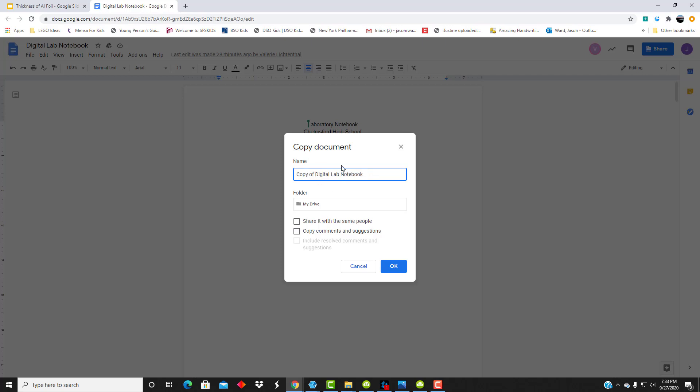Change the name by entering your first and last name and the block that you're in. I'm just going to say A block.